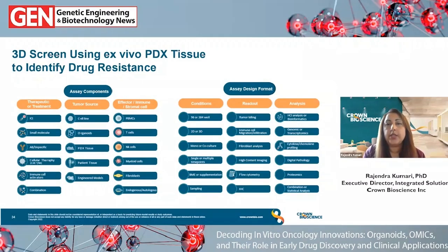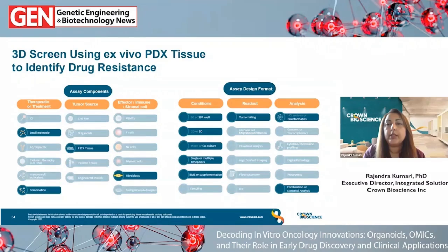So this included small molecules or targeted agents such as HDAC inhibitors, chemotherapeutics, or standard care doublet treatments that are typically first and second line therapies for non-small cell lung cancer. And again, this was to see which models or patients were resistant to those types of treatments. So PDX material was used here.